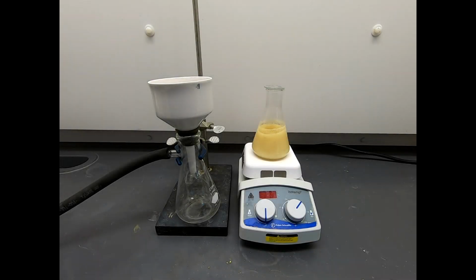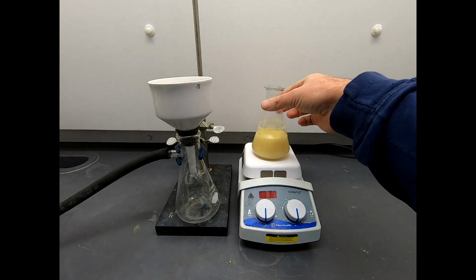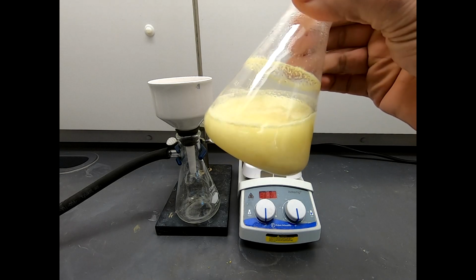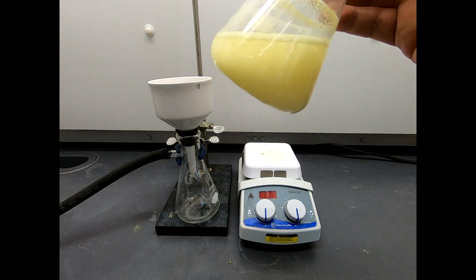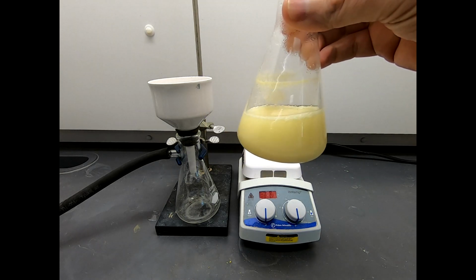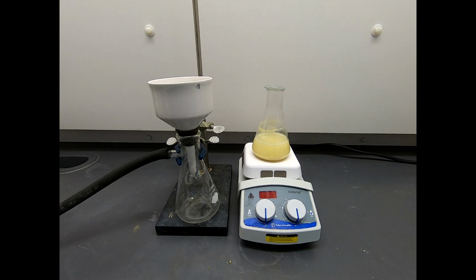Well, this has been stirring for, I'd say, 2 or 3 hours. Turn off the stir plate, and you can see that's fairly nicely suspended. It's pretty fine. Now I promise you there are some bigger pieces hiding within that mess. But anyway, it is a lot finer than it was. And that was really the goal. It's never going to be perfect. We just need it to be good enough.